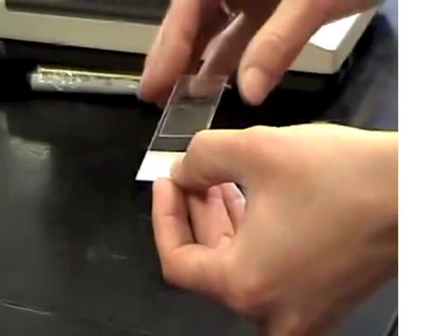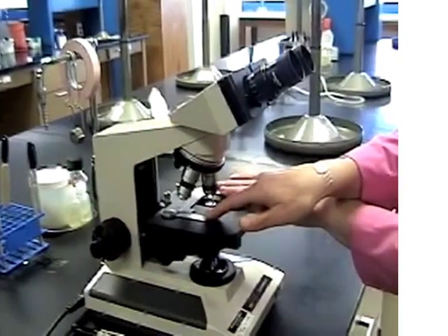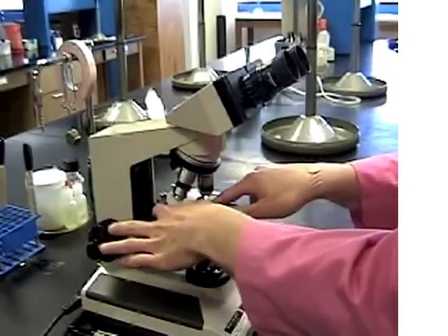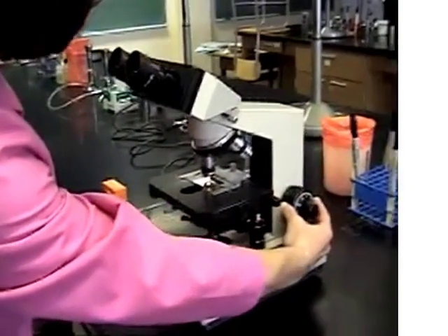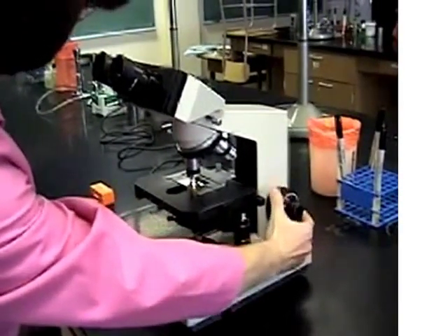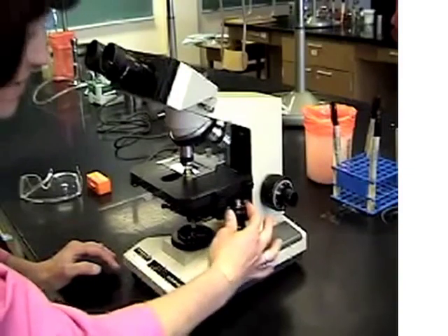Now we're almost ready to look at it. Place it on the stage of your microscope. Notice that your specimen holder has one flexible arm to the left-hand side — use this to allow proper placement of the slide. With your 10x objective in position, use your coarse adjustment knob to bring the stage up as close to the objective lens as possible. You can move the stage around using your X and Y axis controllers to the right and below the stage.